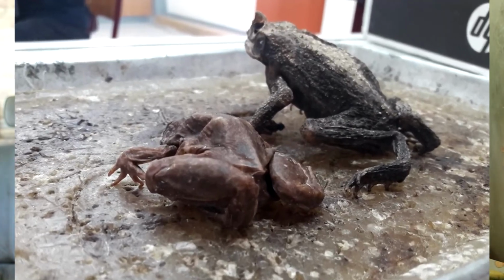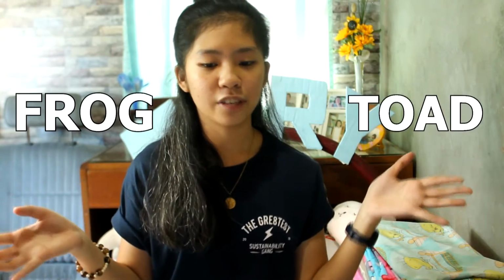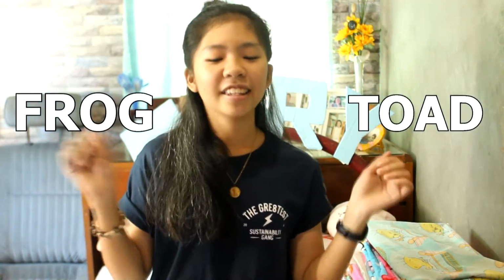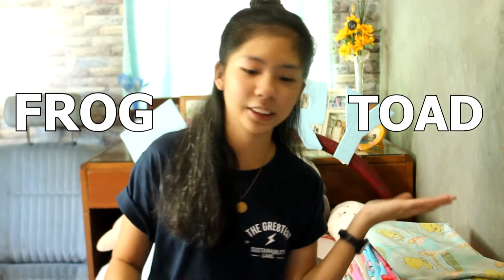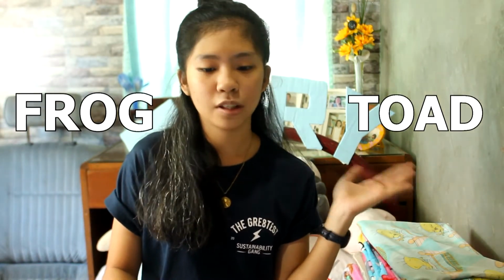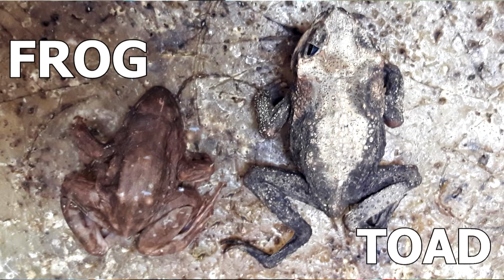Okay, so the skin is smooth and slick sa frog and sa toad kay rough and bumpy. So the eyes are bulgy sa frog and sa toad kay naay ridge over its eyes. Ang hind legs kay long and used for jumping for the frogs. Sa toads kay short and usually used for walking and hopping. The body sa frog kay narrow and smaller compared to the toad. Kaya di ba kabantay mo, mas dako ang toad.